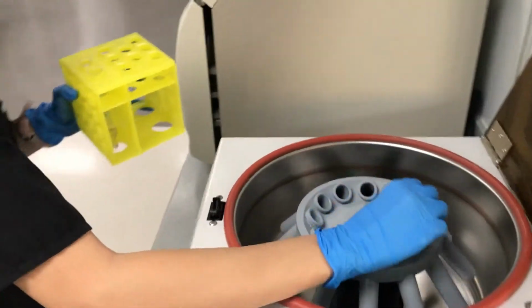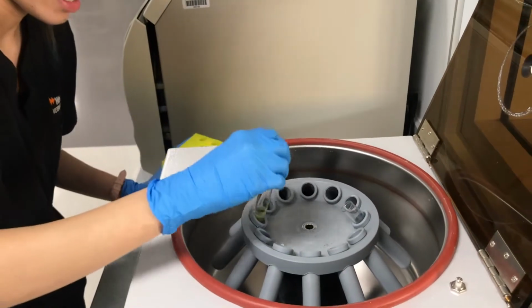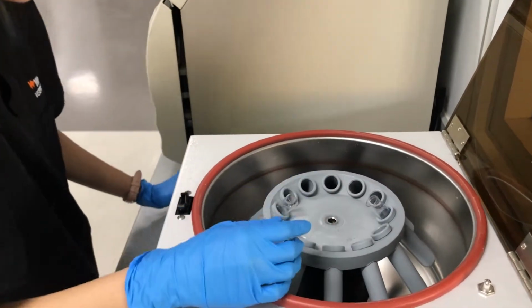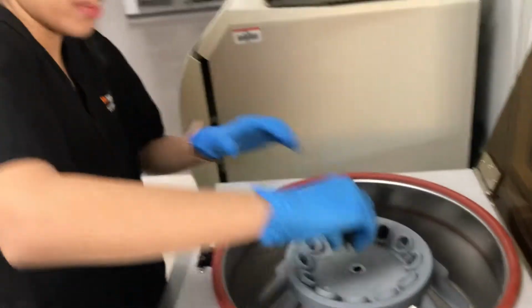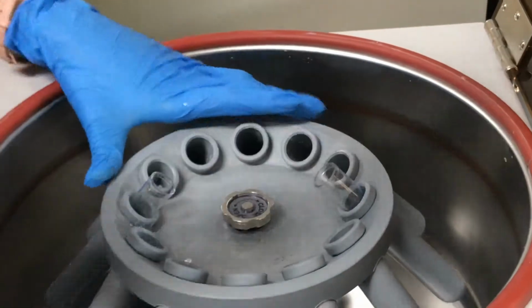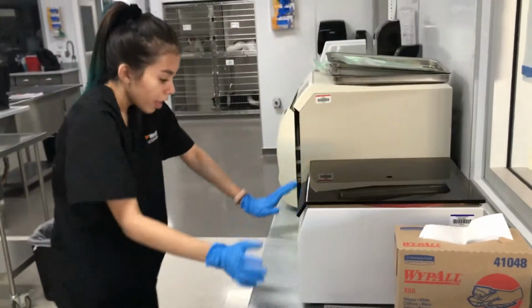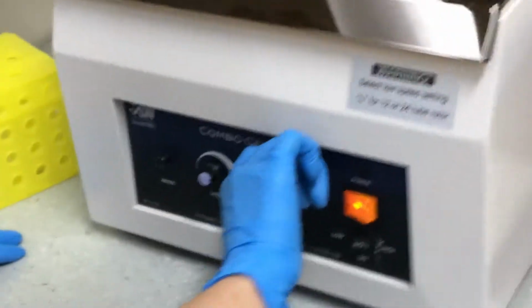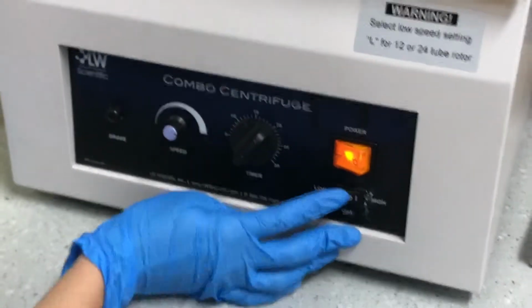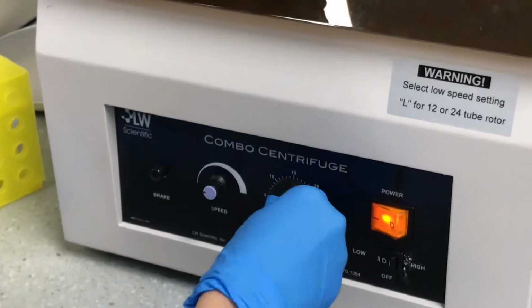And I will be placing these two conical tubes right across from each other so they can be balanced. And we add this, not too tight, so I can get it off when it's done. So I close this, and I will be doing low, and then the lowest speed as well, for 10 minutes.